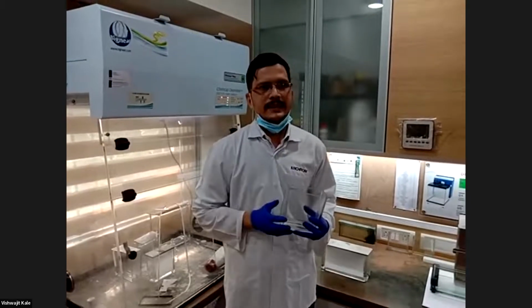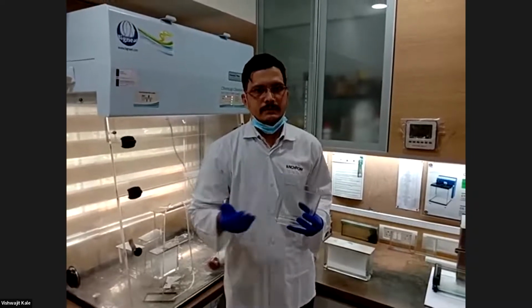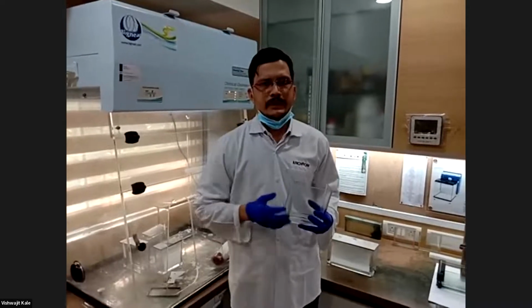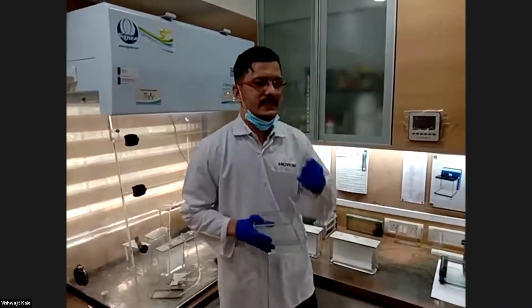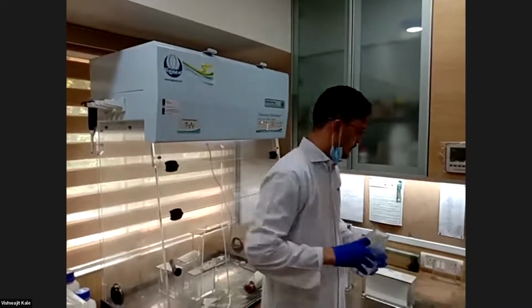So that is the key factor. If we think about column chromatography, where 1 ml per minute will be the flow, if we run the column for 100 minutes, so 100 milliliters of mobile phase we are consuming. So in HPTLC, that is the key factor. Very less solvent for chromatographic development is required.